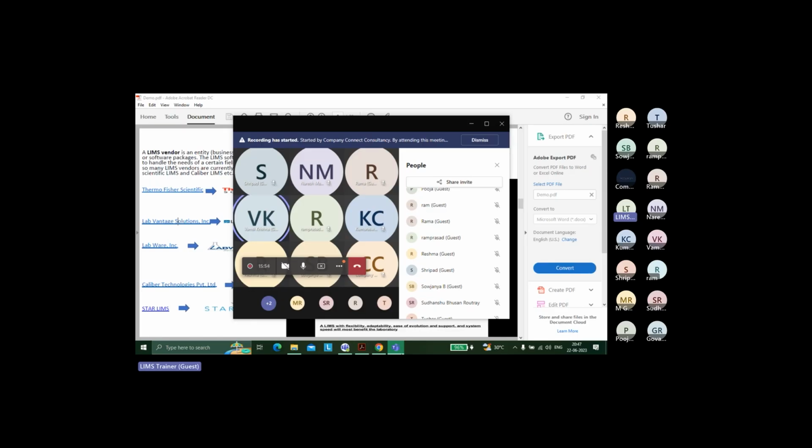Correct, correct. But I'm trying to tell you from a developer perspective, and you are telling from a tester perspective. I agree. But my point is, for example, where scripting comes in: you gave me a requirement that I am doing some content uniformity stage test, and I have two components. Now, if this fails, I need stage two. If this fails, I need stage three.